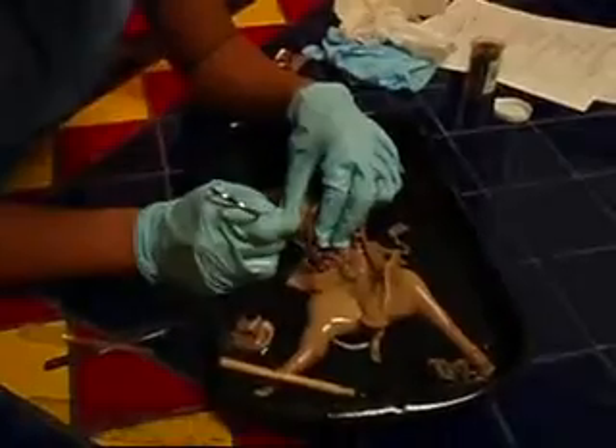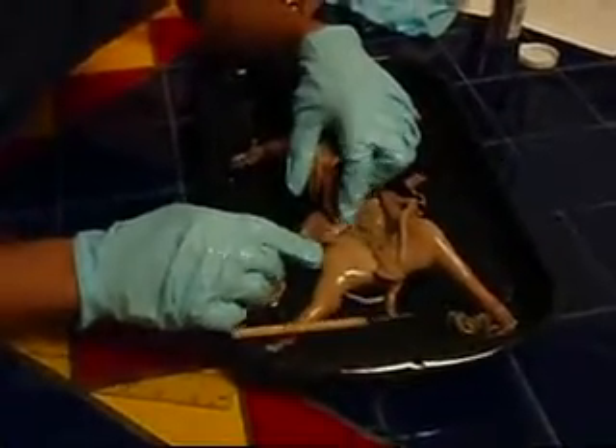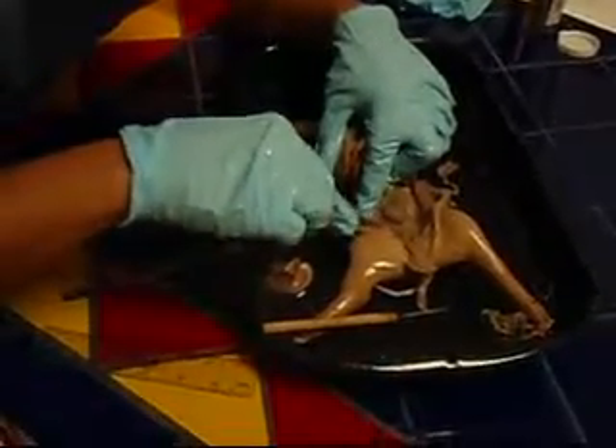Next, we're going to be looking at the urinary and the reproductive system. First, we need to locate the kidneys. The ureters are the tubes that carry urine to the urinary bladder, which is located between the umbilical vessels.